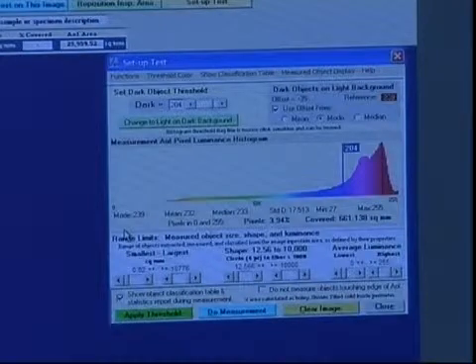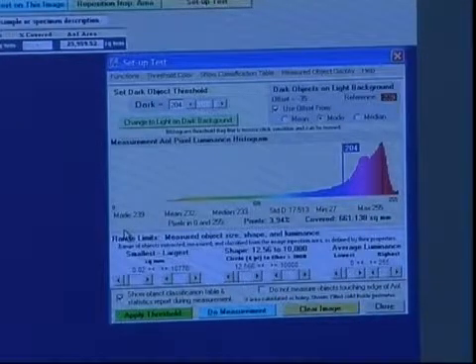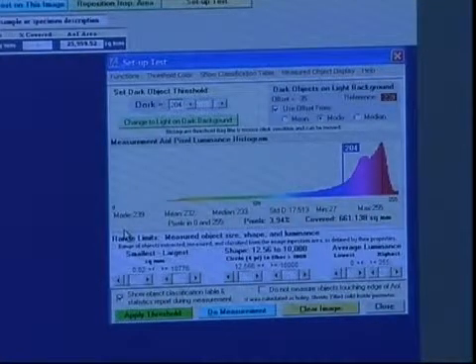The mean in this software is calculated by double calculating the mean. The first calculation of the mean is for the overall intensity within the image or the analysis area, the area of interest, and the standard deviation is also calculated.